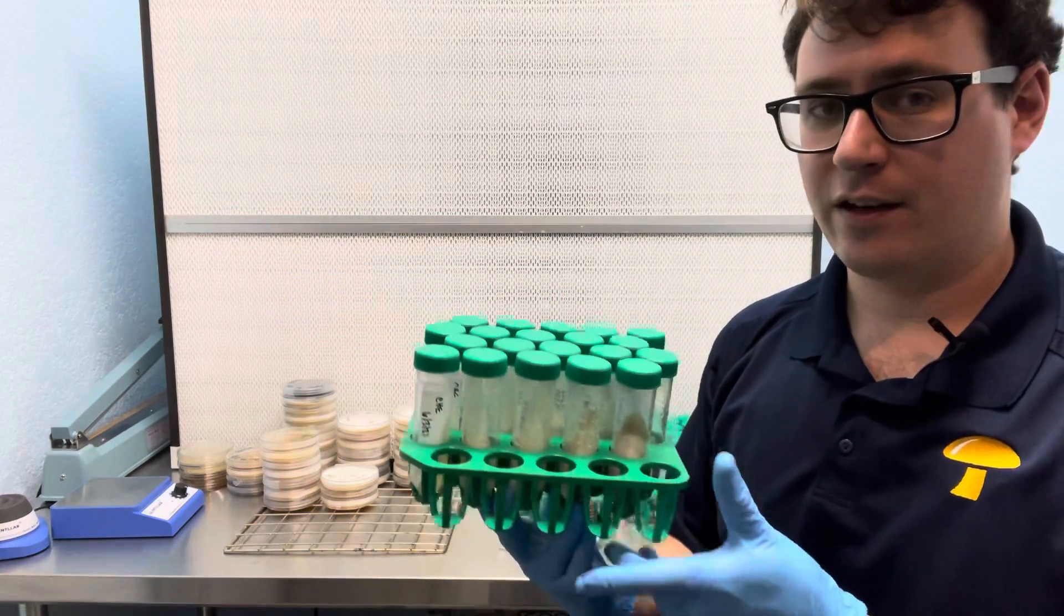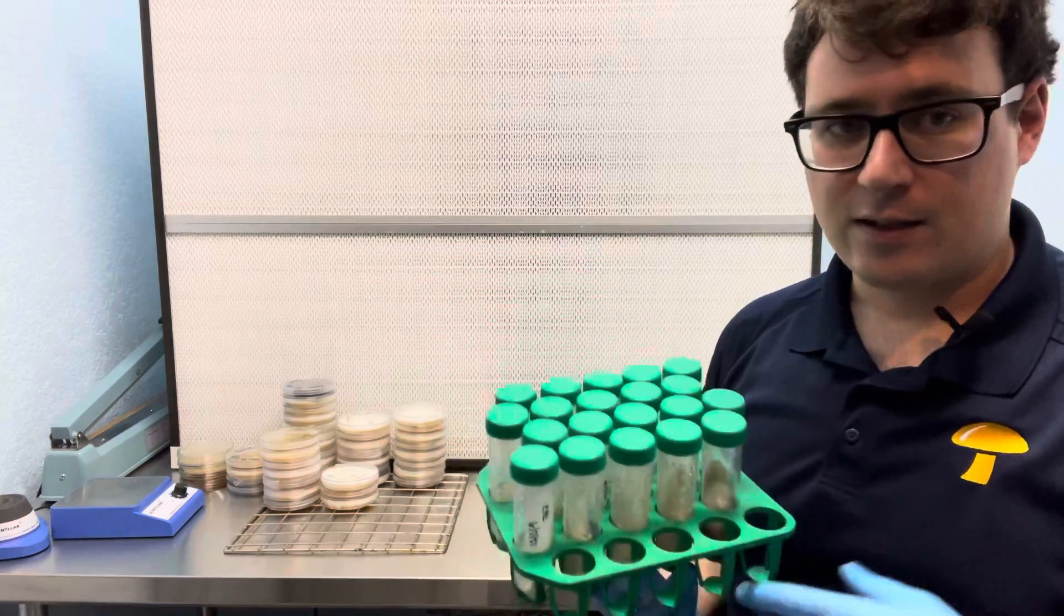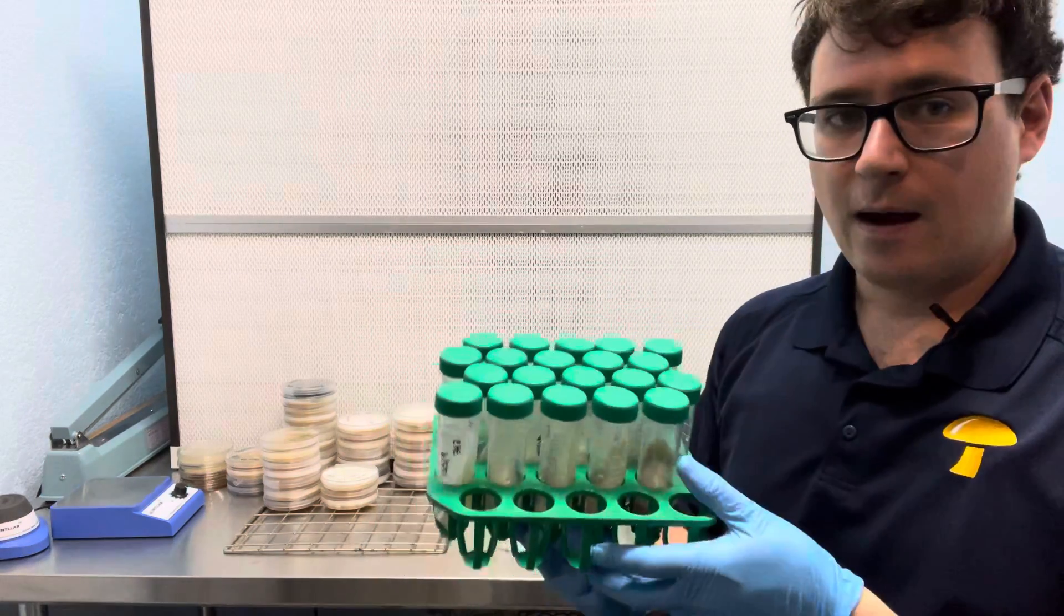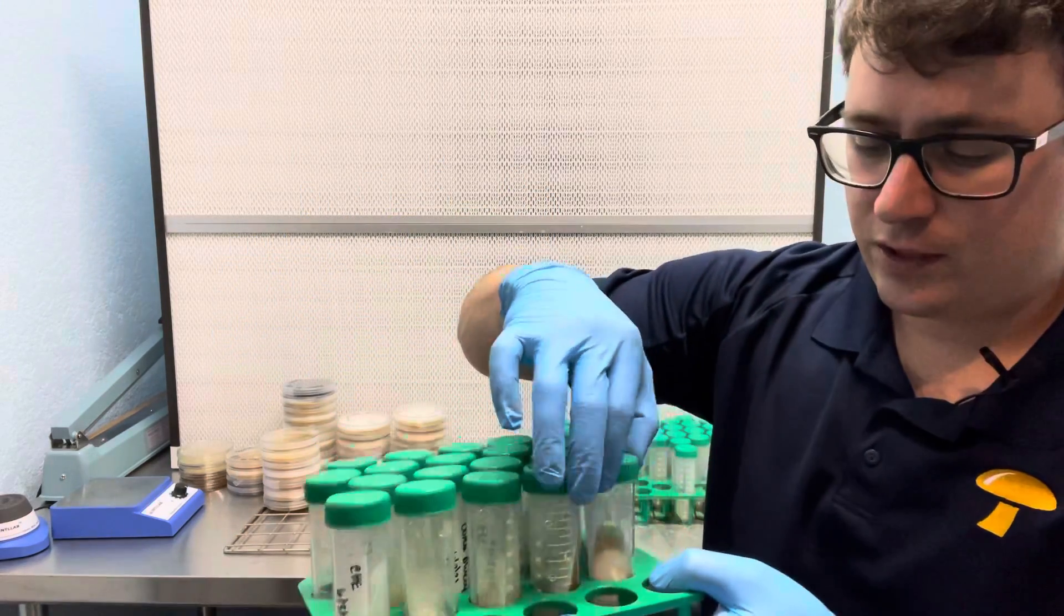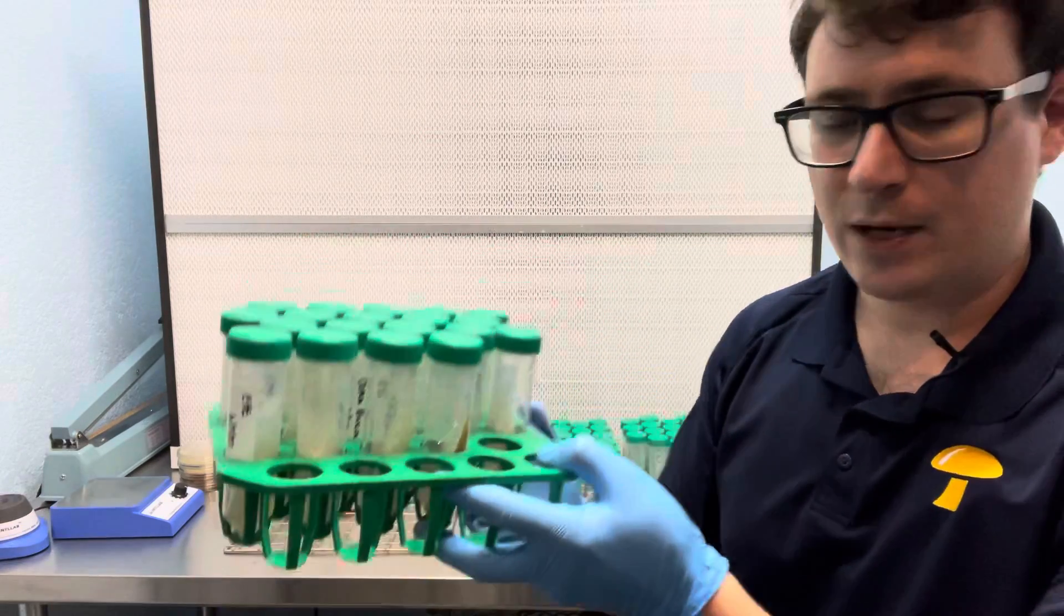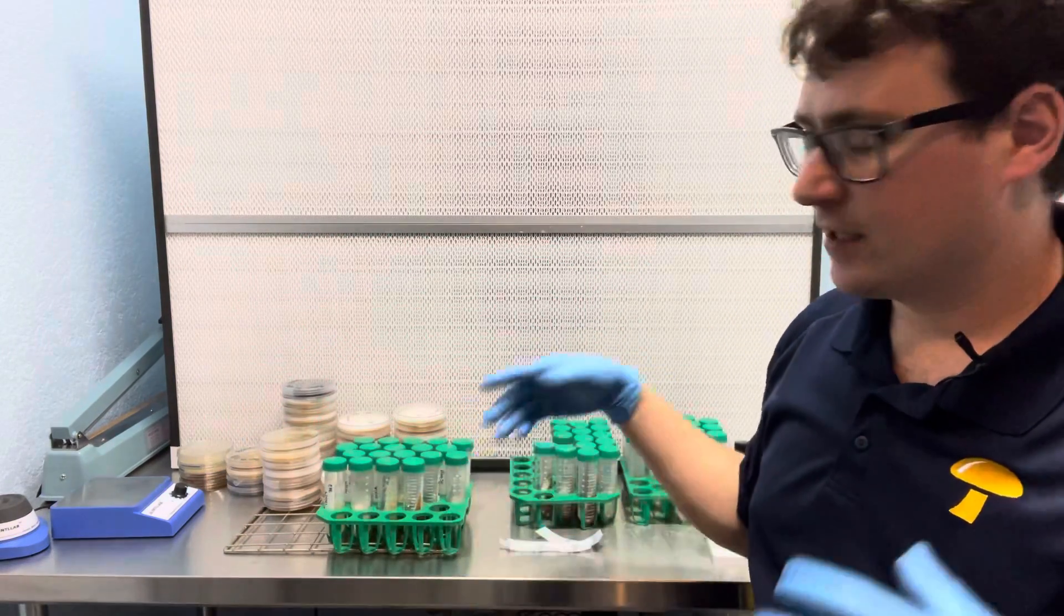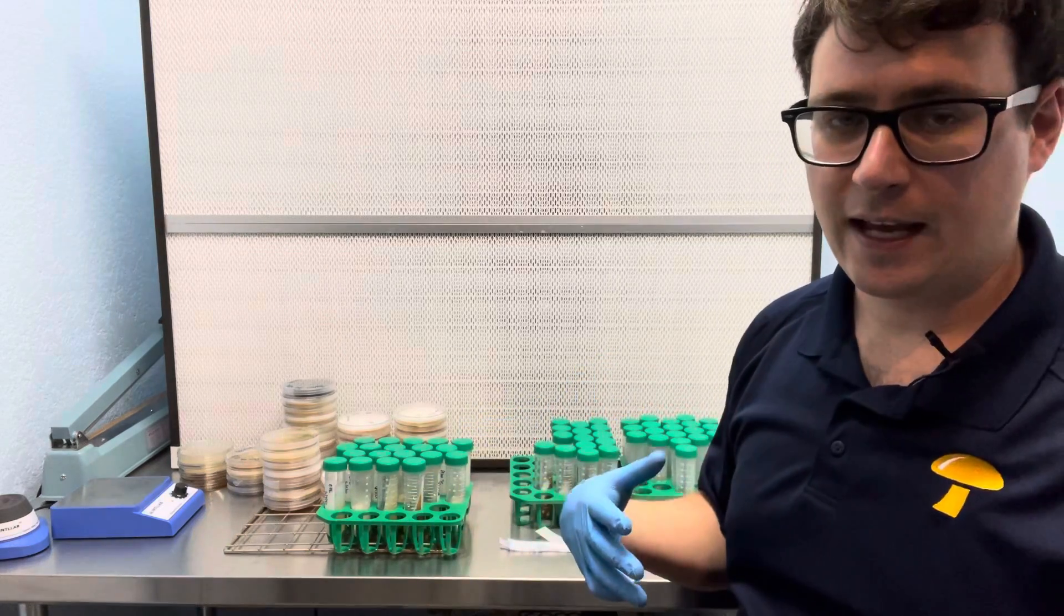The worst case scenario is that the cooler would maybe lose power and it's just going to raise the temperature and that brings me to my next point. So once you pull out your cultures from long-term storage you want to bring them out for a couple days just to give them a chance to come out of their hibernation mode and start growing again.